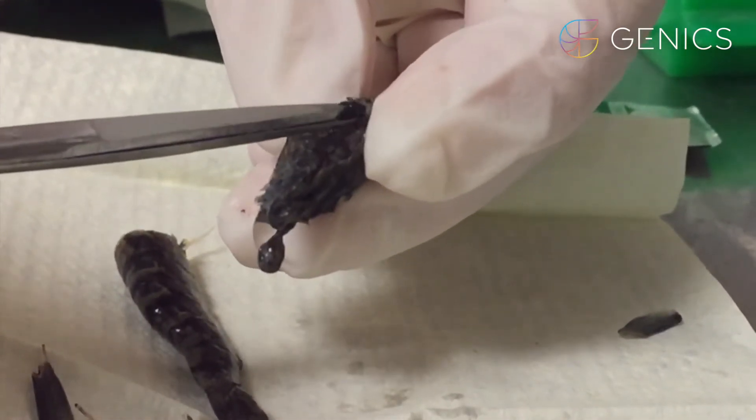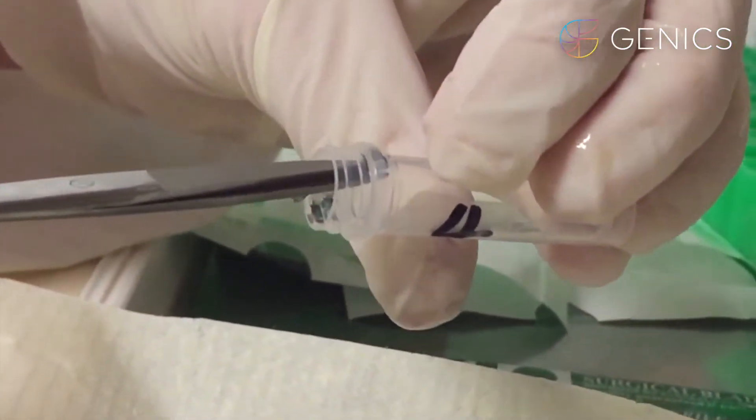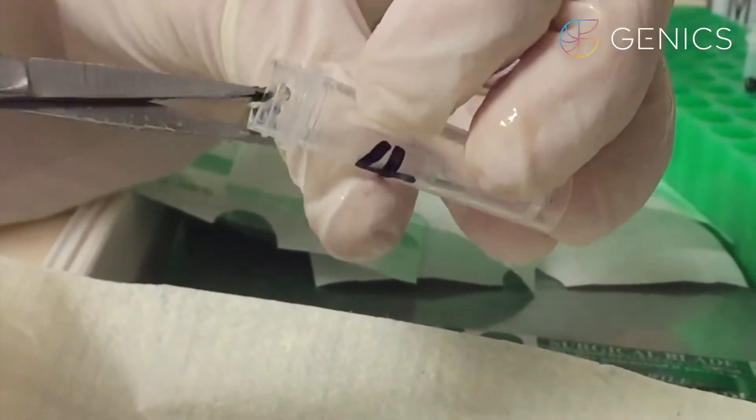Next, we remove a piece of cuticular epithelium and we're going to put that into our tube for shrimp multipath testing.